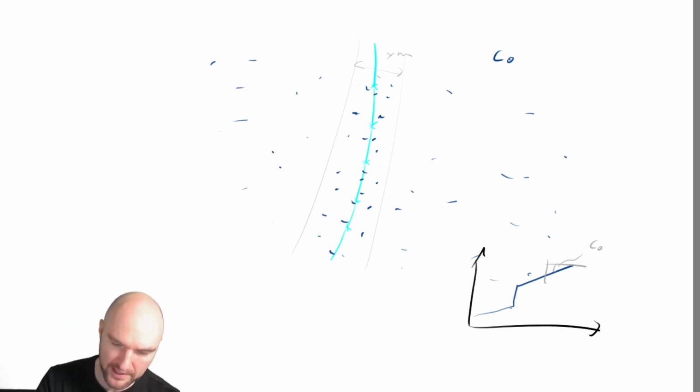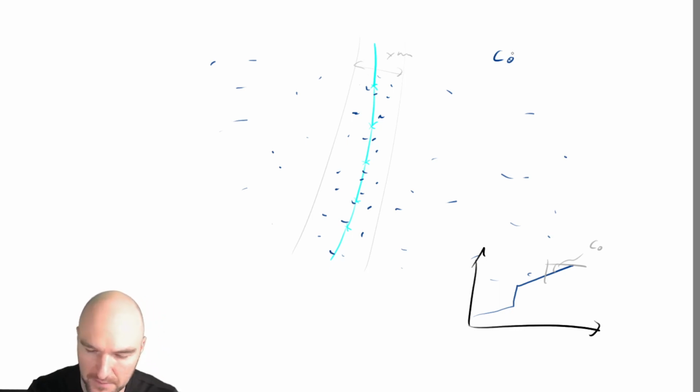What we have done is wrapped that thing around itself, and we've determined one Z0 for the data set. It's a bit of a limitation of that algorithm, but I haven't moved the full powered algorithm that does a cumulative curve for each one of the vertices into the new toolbox yet. But I guess I'm going to do that pretty soon as well.